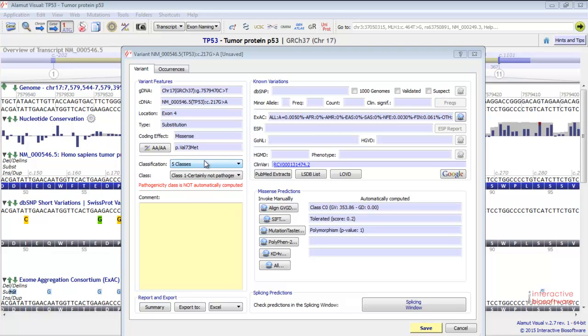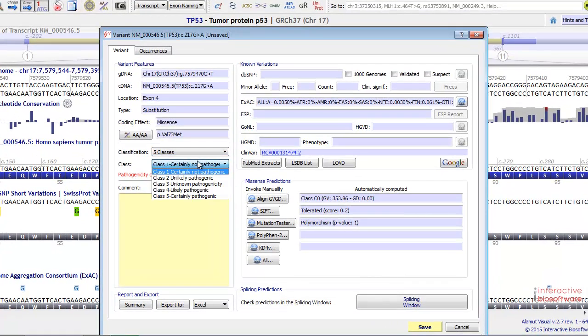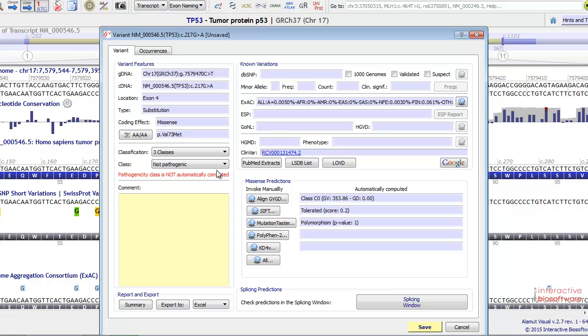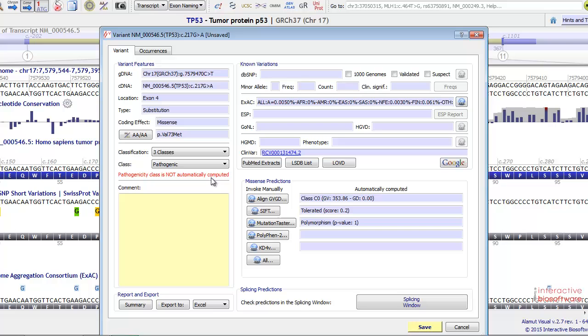Here you can classify your variant based on its pathogenicity. You have the ability to choose the class for the report. Either the five classes report, which goes from certainly not pathogenic to certainly pathogenic, or the three classes report, which goes from not pathogenic to pathogenic. Please note that the pathogenicity class is not automatically computed because Alamut Visual doesn't have any information about the patient, his phenotype, disease, or his environment.